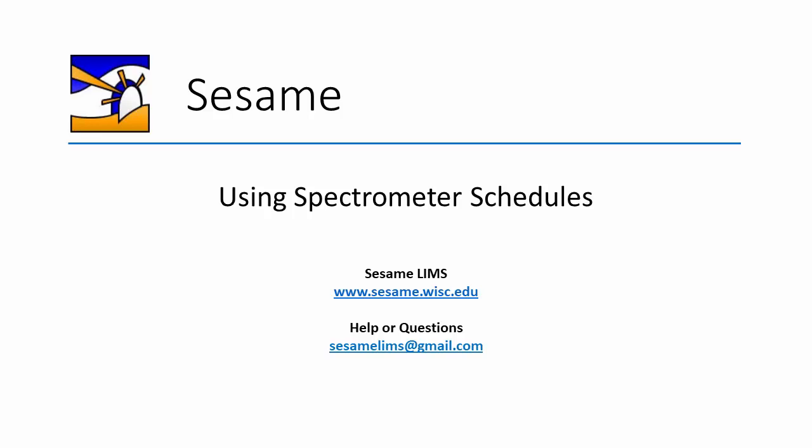Hello and welcome to this video tutorial about scheduling time on spectrometers in Sesame. Today we will be working in the Sundial module.